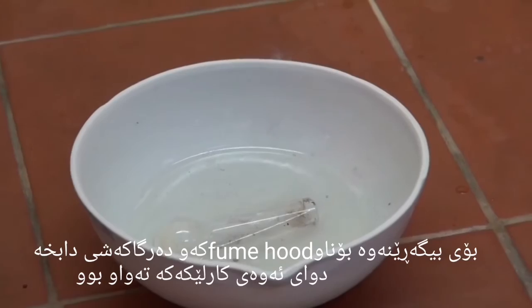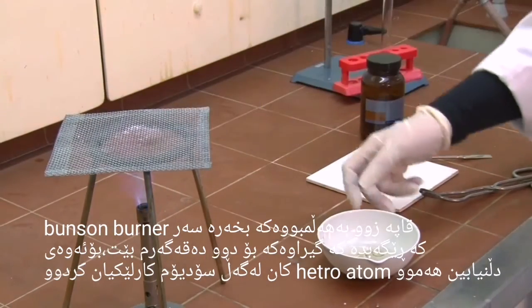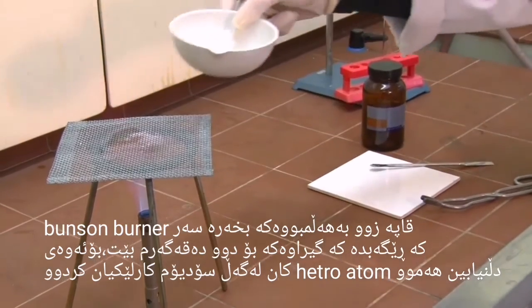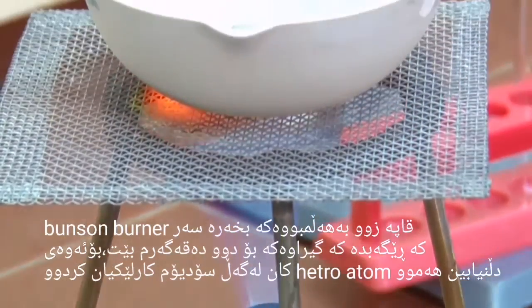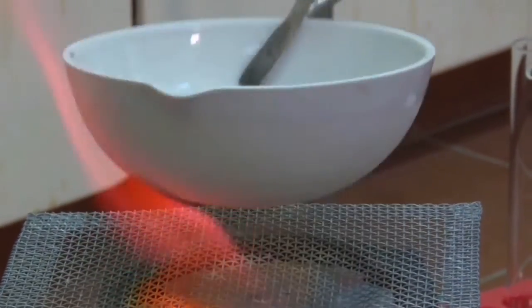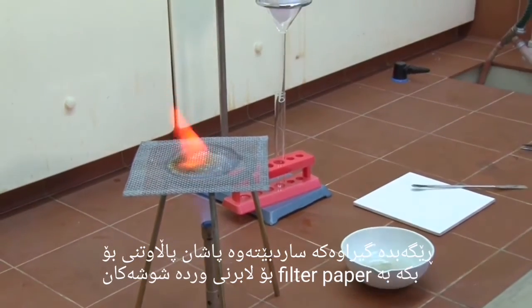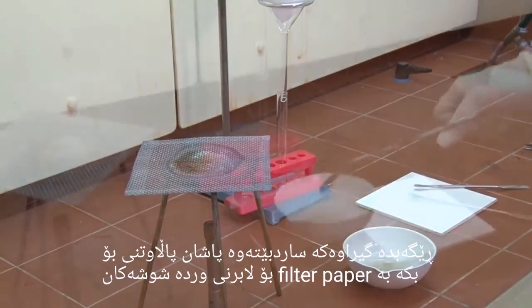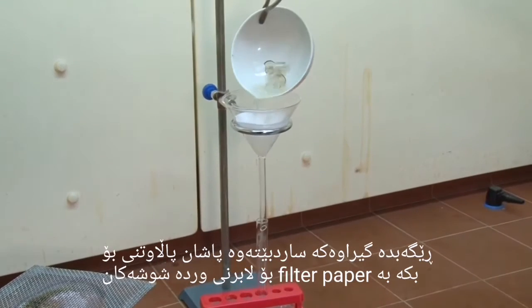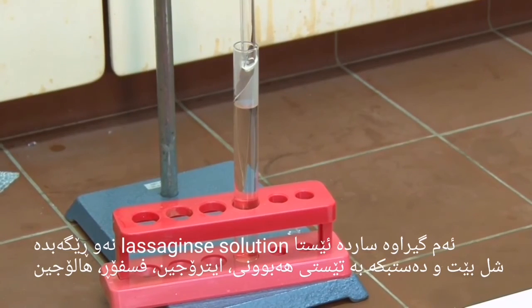After the reaction's finished, put the evaporating dish over a Bunsen burner and let the solution boil for about 2 minutes. This will make sure that all of the heteroatoms react with the sodium to form ions. Let the solution cool down and then filter through a Whatman filter paper to remove all of the glass. The solution that you have now is called Lassaigne's solution.